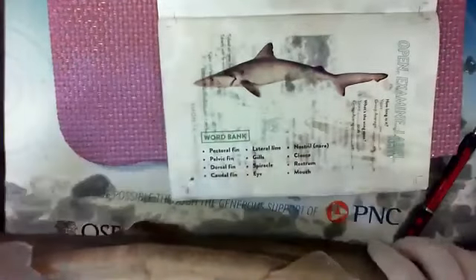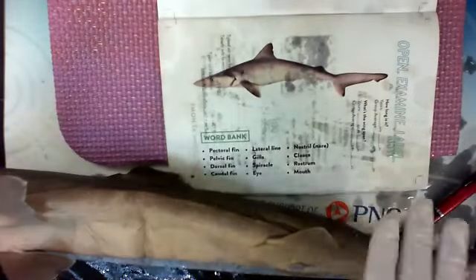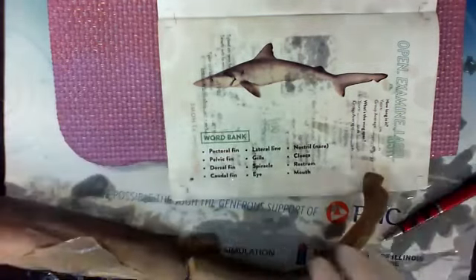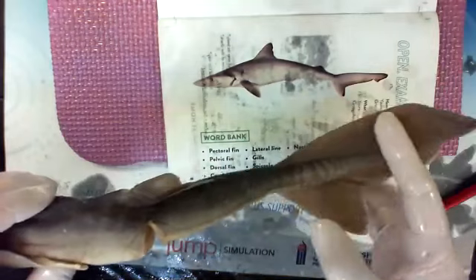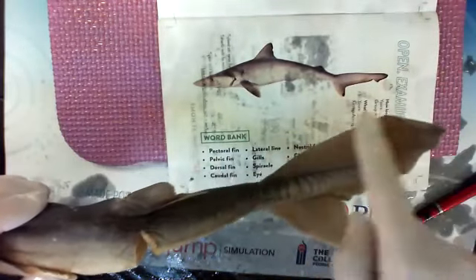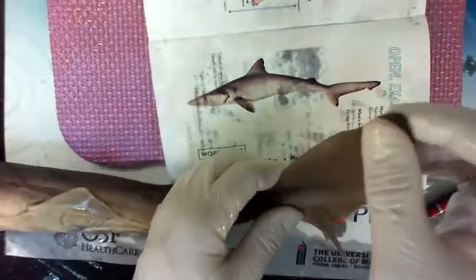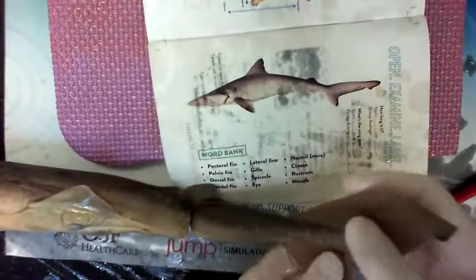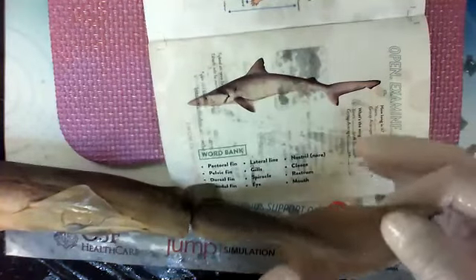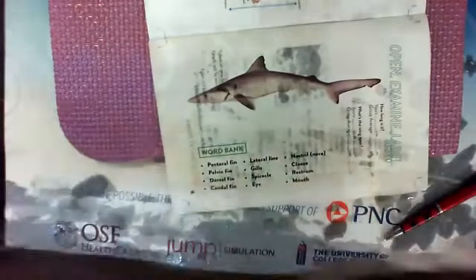Okay. Next, caudal fin. So that's the anatomy again, the directions. Where's caudal? Is it referring to towards the head or towards the tail? Towards the tail. So the caudal fins are at the very end of the tail, paired. Some say that they're one single one, but others say it's paired because they're different shapes. Depending on the shark, I guess. Some have a real long whip on the tip so they can snap things. Others just use it like rudders. Some have big floppy ones. Those are the ones that just look pretty and not really practical. But this is more like a rudder because this is a fast shark.